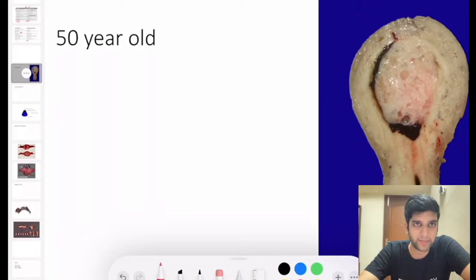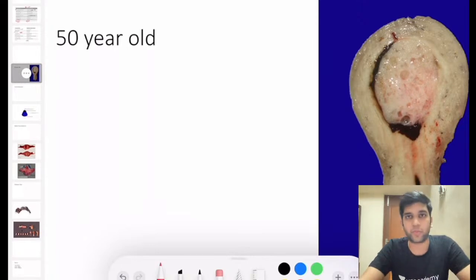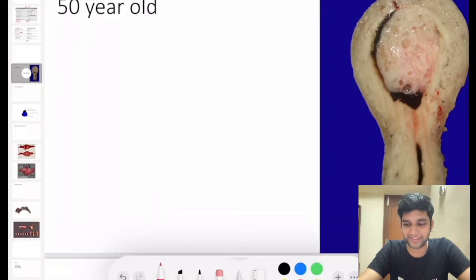Okay, describe the image and give me a possible or probable differential diagnosis. I know Manpreet and Ramya are online, so I would ask you guys first. Others who are there, please pitch in, and I want a differential diagnosis. Then we'll try to discuss a few things about grossing: a normal cervix, normal uterus, benign, neoplastic, how to gross them, what all biopsies, what all bits to take. Fine. No one wants to take a call. Simple image, right?